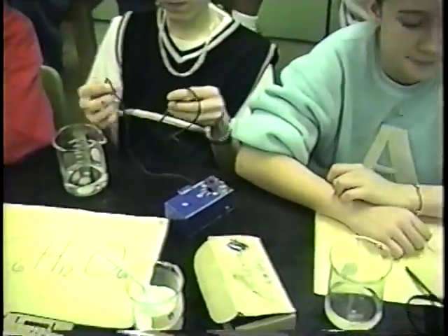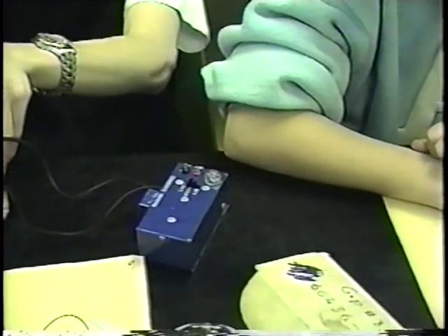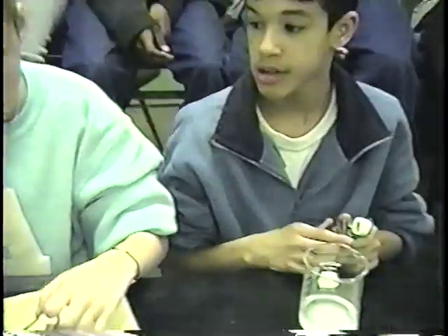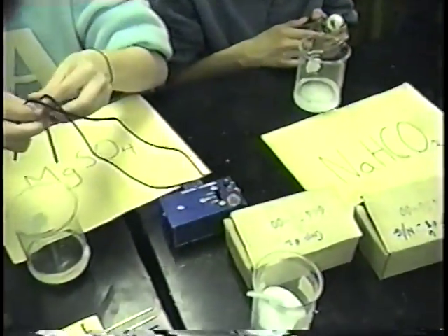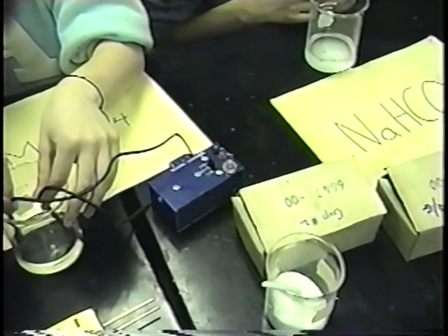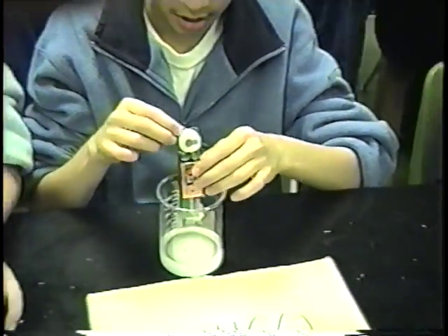Okay, you're going to put in the blue box now to test the sugar, and what's the deal on your light, Kyle? It's not on, so what's your choice? Non-electrolyte. You're testing the Epsom salt. Make sure your light is turned on. Place it in. And what type of light is coming on right now, Avery? Dim, real dim. So what type of electrolyte is it? Weak.